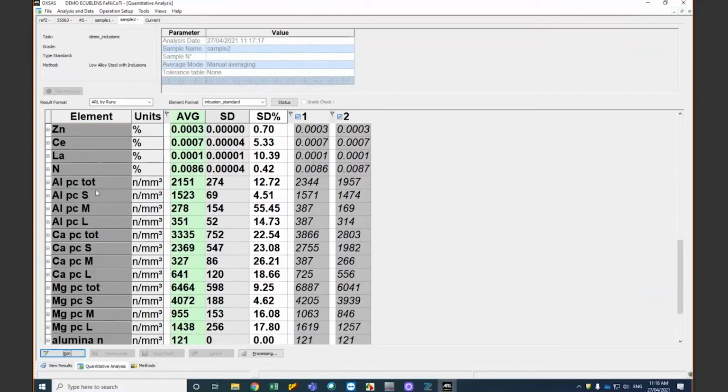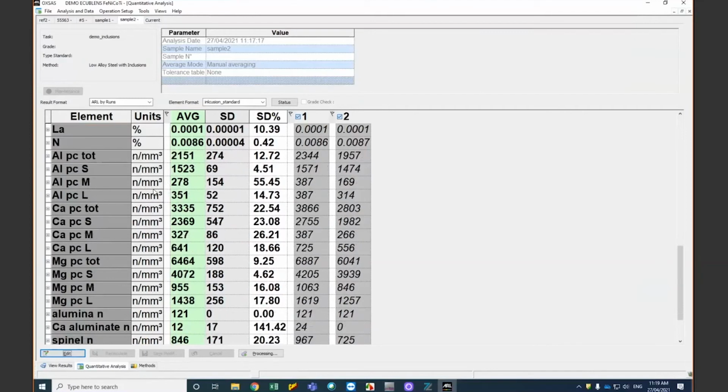And we normalized the number to the cubic millimeter. That way, you are able to compare between different method conditions. And we have these small, medium, large groups for the peak count, depending on the threshold defined according to the intensity level. So it's like a qualitative size separation.